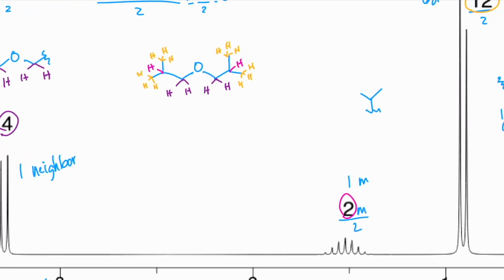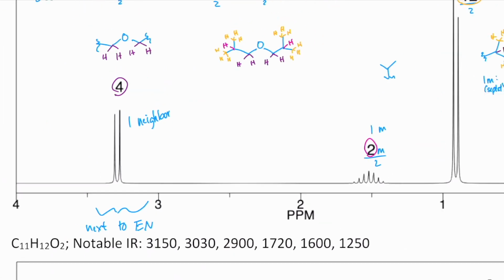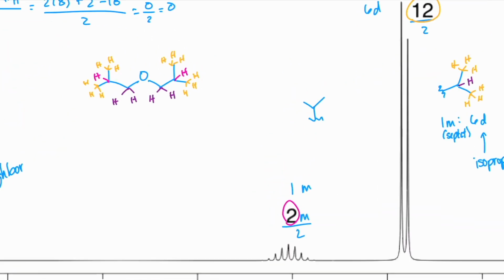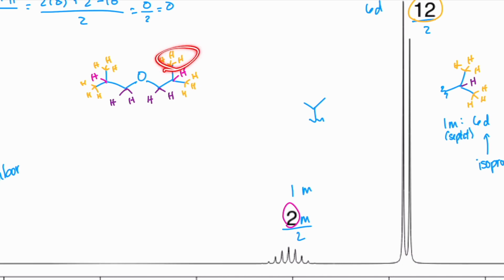Let's see. These 4 purple hydrogens are pretty high up. That makes sense. They're next to an oxygen. This multiplet, not just the splitting pattern makes sense as we talked about, where it's being split by these 6, but also this is decently close to this oxygen. We talked about the nearest directly bonded effect of these electronegative atoms, but their proximity to them also matters. A closer hydrogen to an electronegative group will be further to the left than one further away.